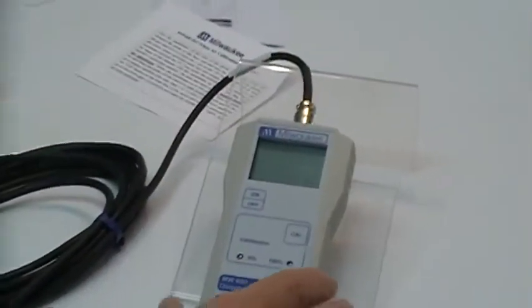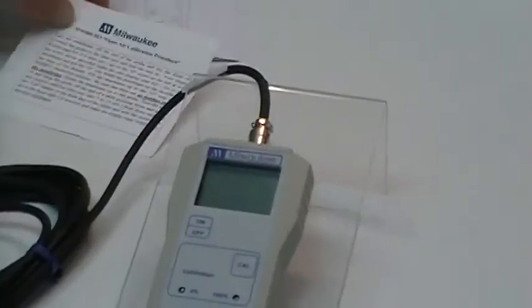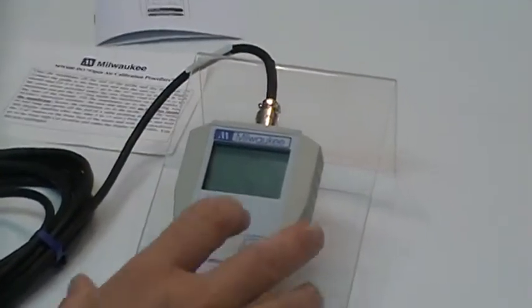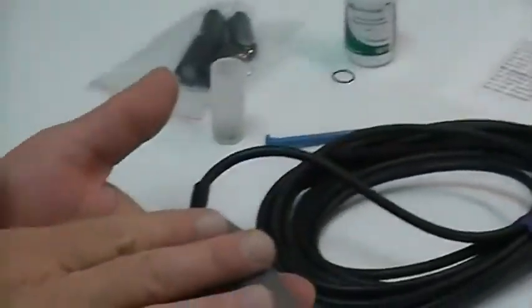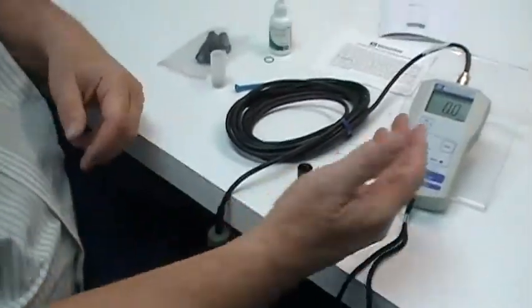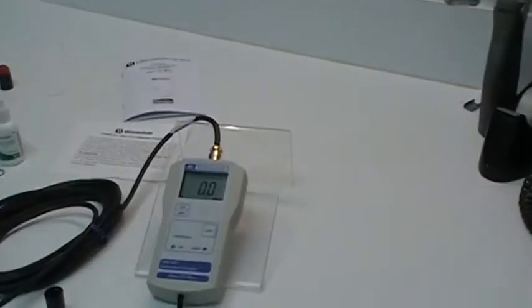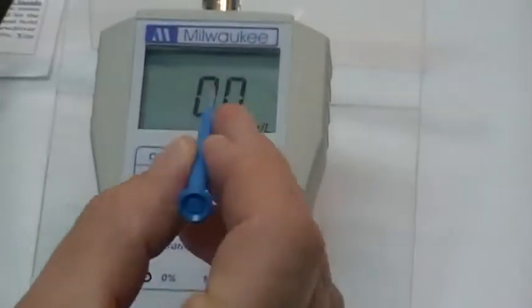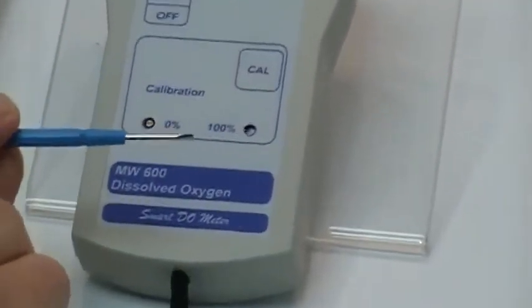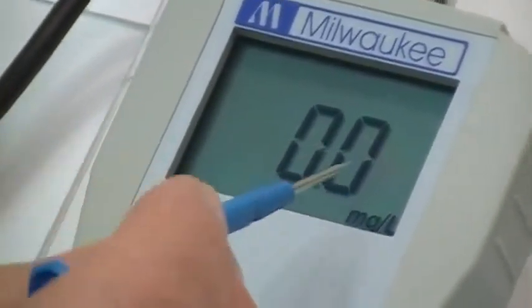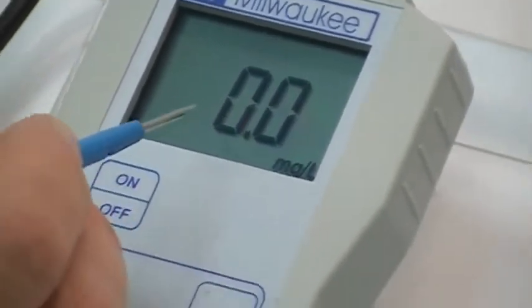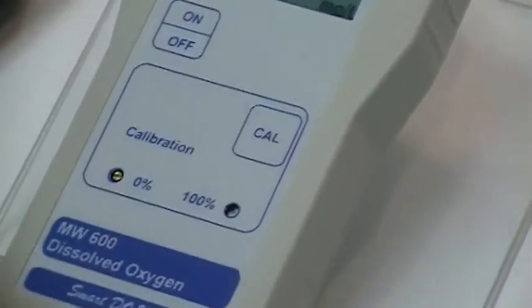At this point, according to the open air calibration procedure, you're going to turn your unit on with your probe and an exposed diode, no membrane. You should see a 0.0 come up on your screen. If you do not, go to the zero with your provided screwdriver and dial it in to where you do see 0.0, not a negative or any other figure. This is what you want to start off with to zero the unit.